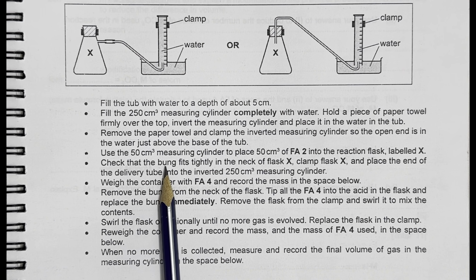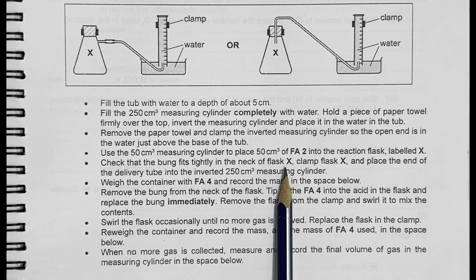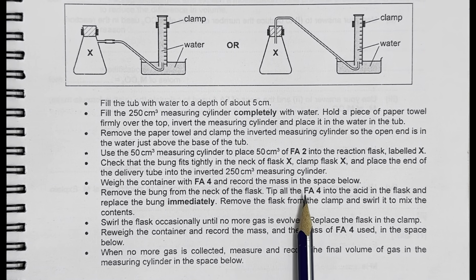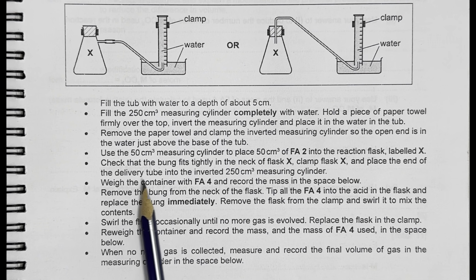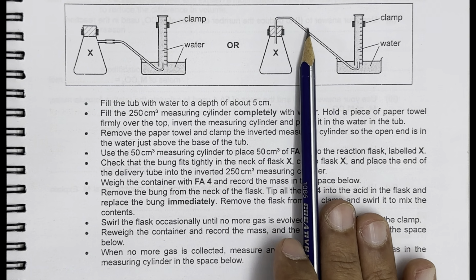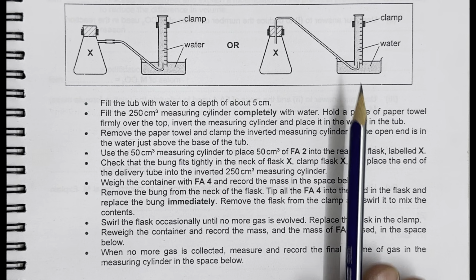Check that the rubber bung fits tightly in the neck of the flask X, so that the gas which will form here will not leak from these openings. Then place the end of the delivery tube into the inverted 250 centimeter cube measuring cylinder. So now here we have this delivery tube which is passed under this measuring cylinder.